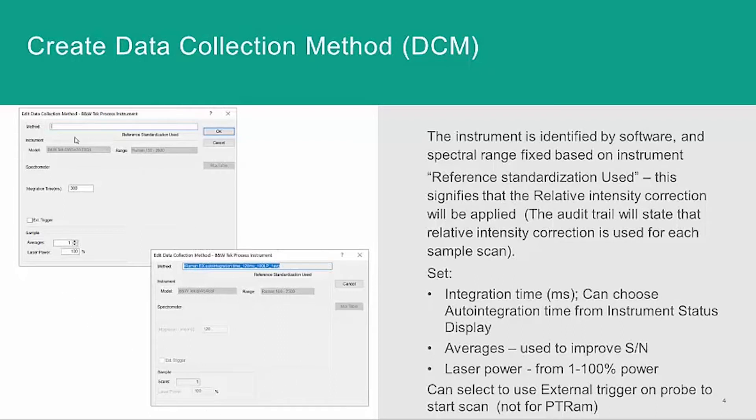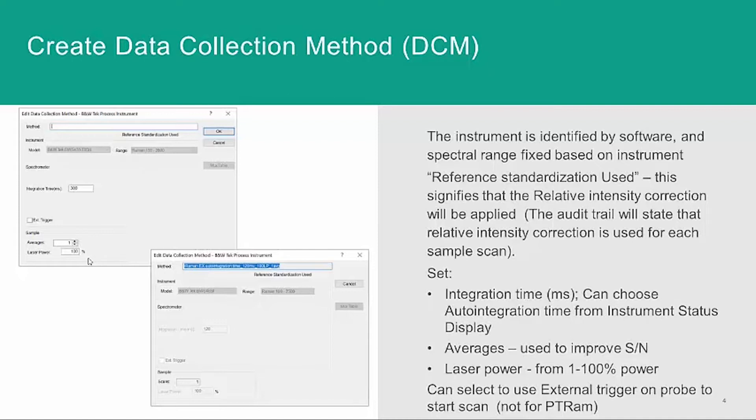But a new DCM does have the ability to change the acquisition parameters of integration time in milliseconds, the number of averages, which can be used to improve the signal-to-noise ratio of your spectra, and the laser's power from 1 to 100%. You also have the option to select an external trigger if that option is available.